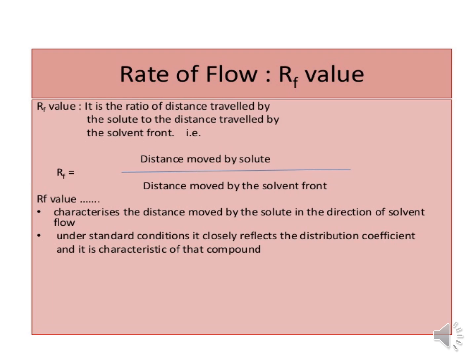The main application of chromatography is separation of amino acid mixtures. So we use paper chromatography in the separation of mixtures, taking a mixture of amino acids. The following operations are involved: choice of filter paper, preparation of the solution, application of the sample to the paper, choice of the solvent, developing of the chromatogram, drying the paper, location of the substance on paper chromatograms, and quantitative estimation.